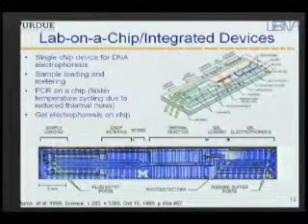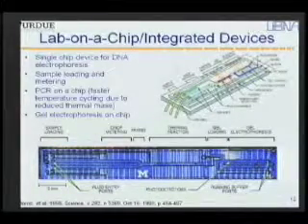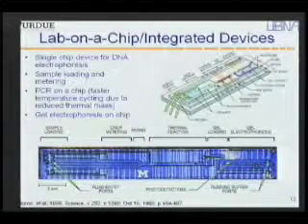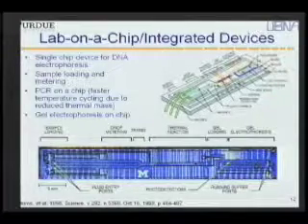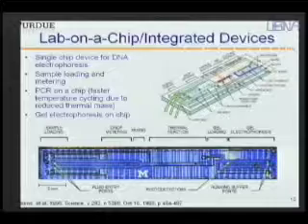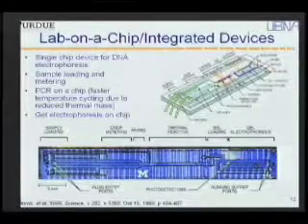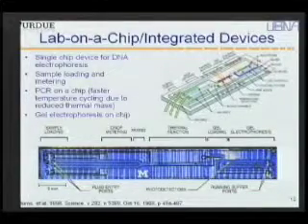In this particular case, they also integrated silicon photodetectors on the chip to get an optical detection using an electrical signal, of course. So this is a nice example of an integrated device that does everything from taking a raw sample of fluid which has some small DNA to doing a PCR reaction and then running a gel and detecting the presence of specific DNA.